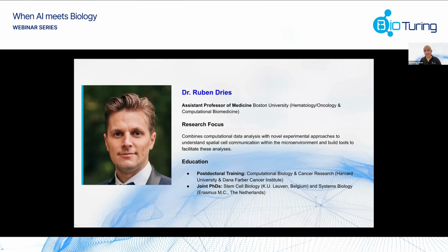Ruben will walk us through the very fast evolving landscape of spatial technologies, from single modality to multimodal, and quickly from 2D to 3D, and the many computational challenges that come with them.